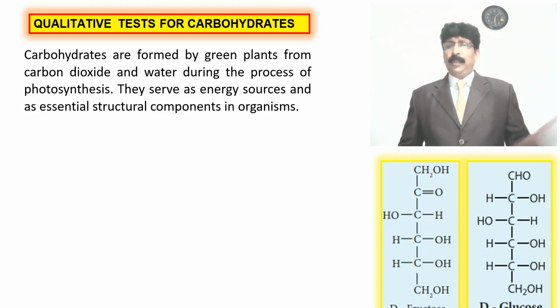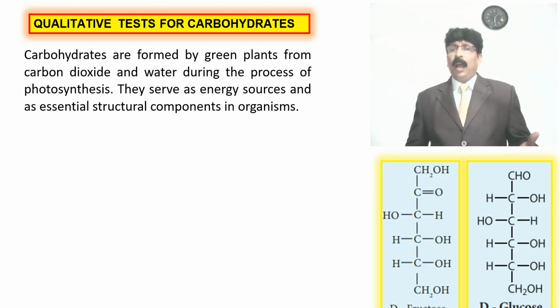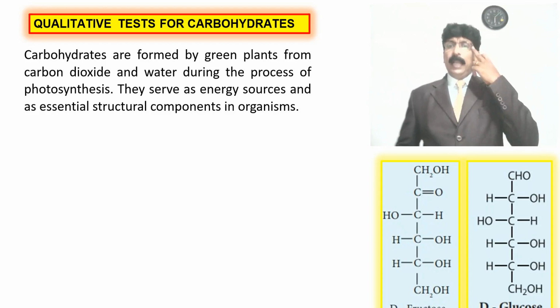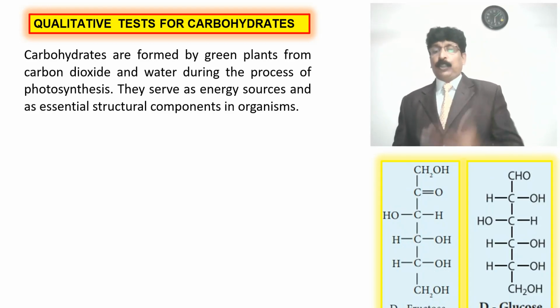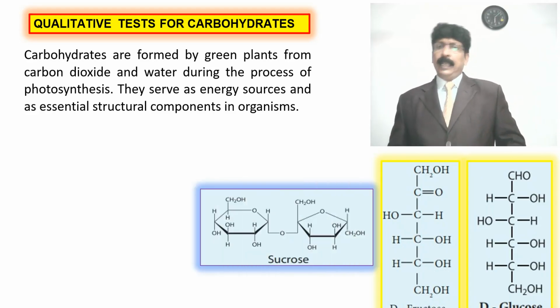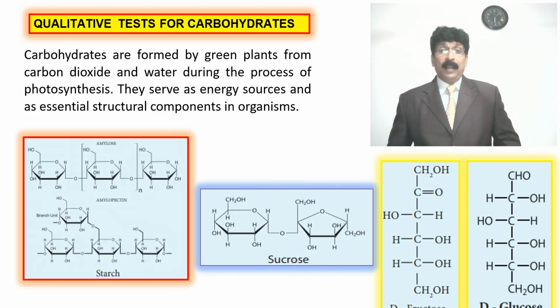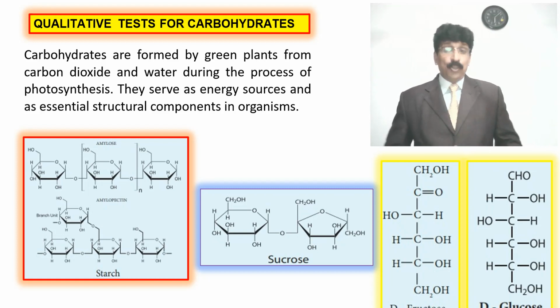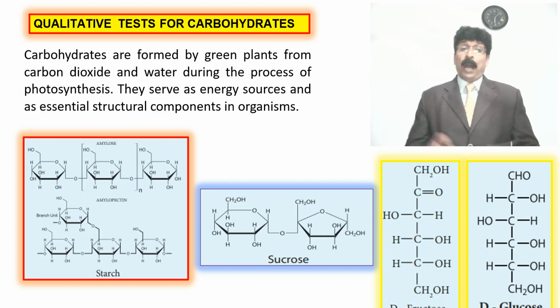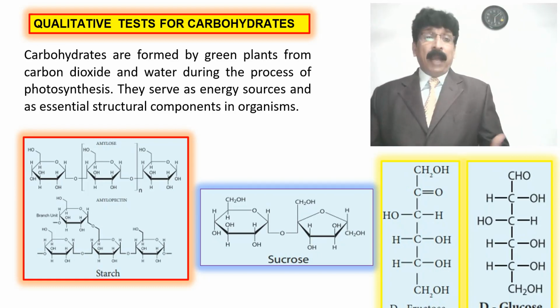You might have studied D-glucose as an aldose, and differentiated carbohydrates like that. Fructose is also a monosaccharide, but it is a ketone derivative. Sucrose is a disaccharide example. For polysaccharides, I have taken starch, with its water soluble and water insoluble parts, amylose and amylopectin.